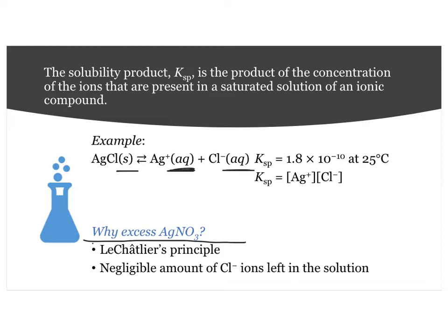On the other hand, some ionic compounds, like silver chloride, have a low solubility product. Therefore, most of the ions are in the form of precipitate. However, there are still free ions in such solutions. So an excess amount of precipitating agent, here silver nitrate, is added.